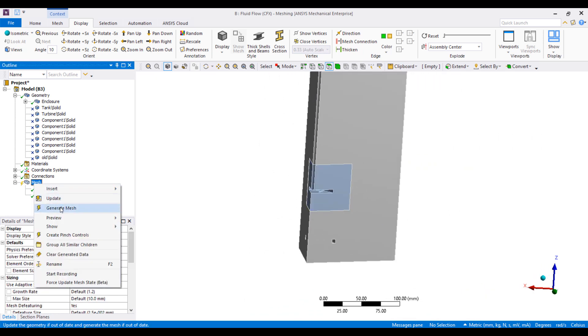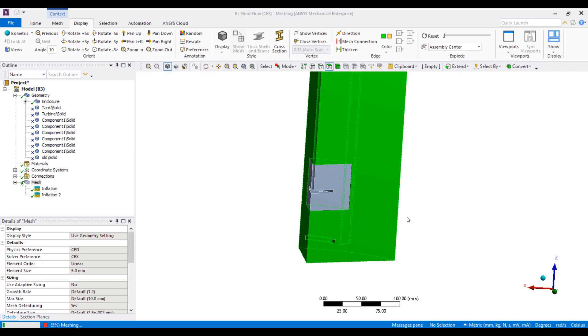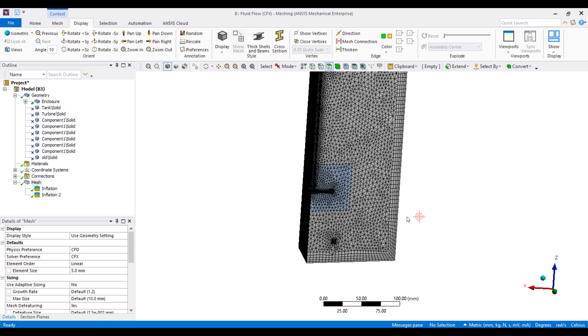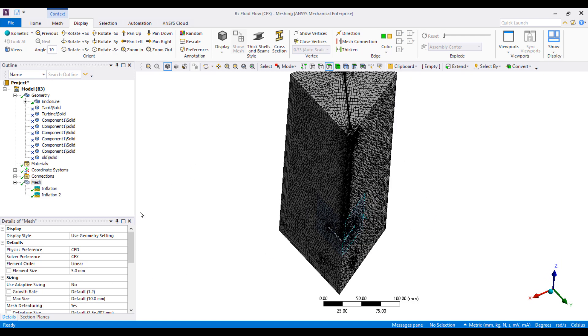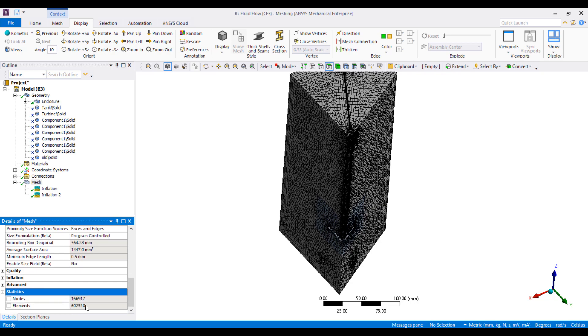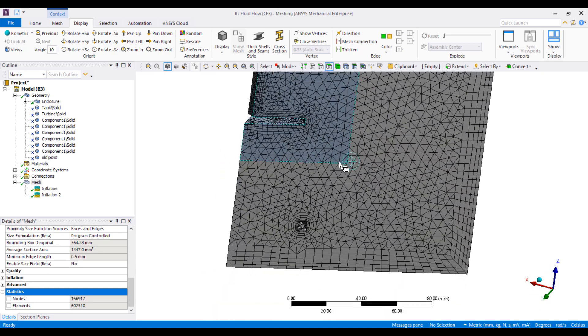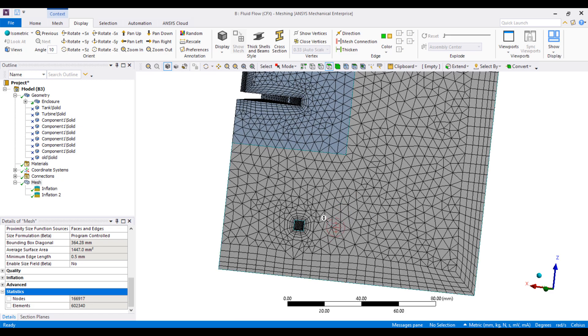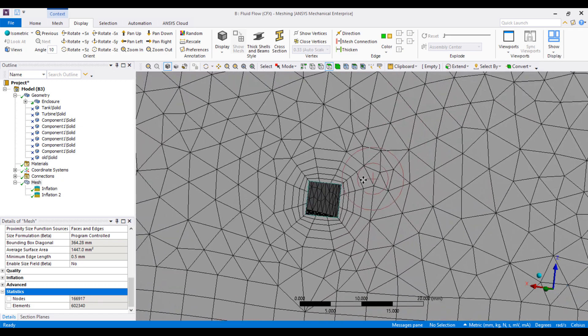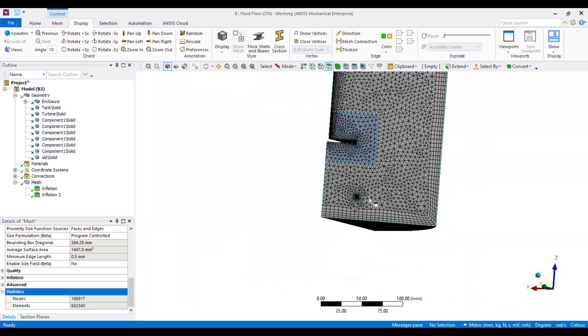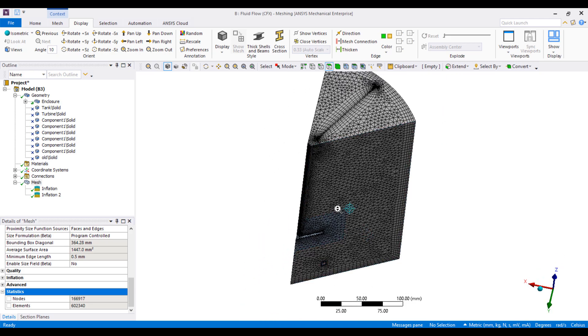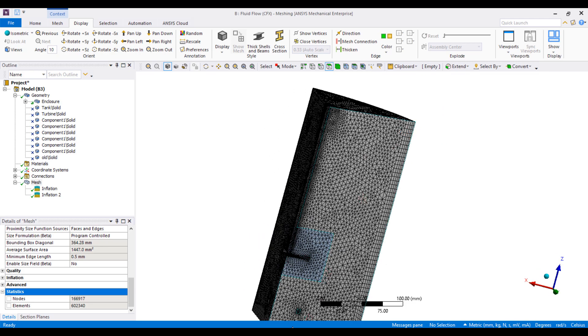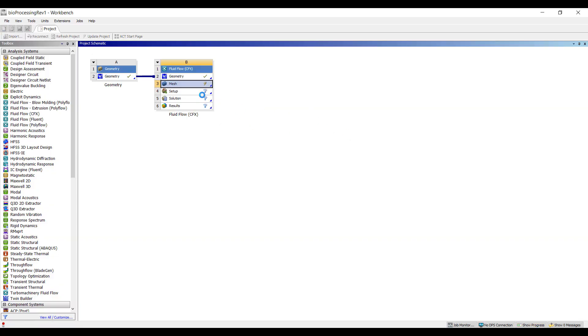You can see the wall surfaces are selected. So I think that's all we need to do for the meshing part of it. You're welcome to create some name selections, but it's pretty easy for simple models like this just to pick the boundaries once we get into ANSYS CFX. The model's been generated. We have about 160,000 nodes. CFX is a vertex-centered finite volume tool, so that corresponds to about 160,000 control volumes. Let's go back to the project page and get our simulation started.